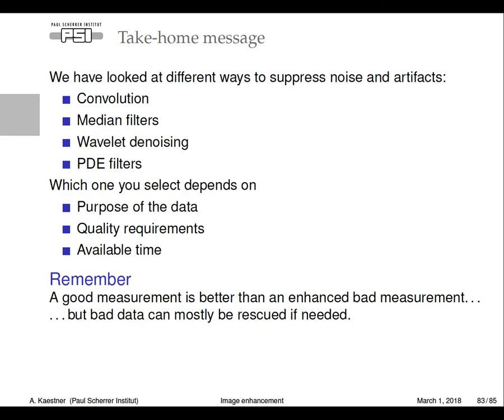So it's a little bit about what you need and how big a sledgehammer you need to take. Which one you choose depends on the purpose of the data, quality requirements, and available time. Sometimes it's actually enough to do quick and dirty, just give it a convolution and you get the first idea, but it may not be sufficient for the final analysis.